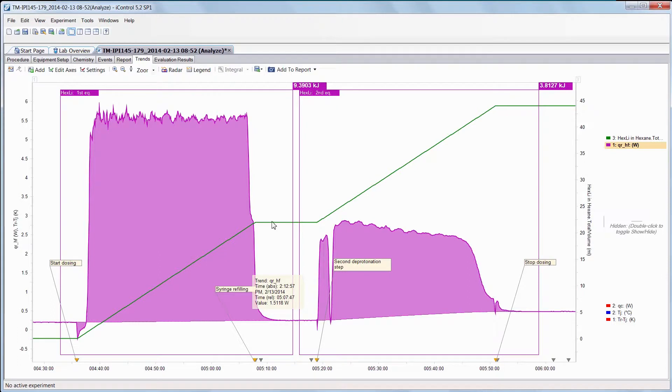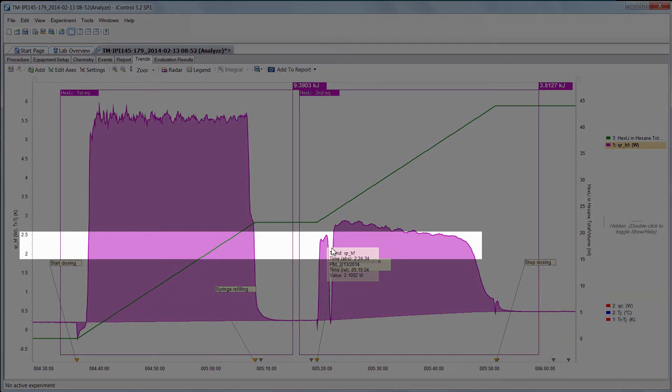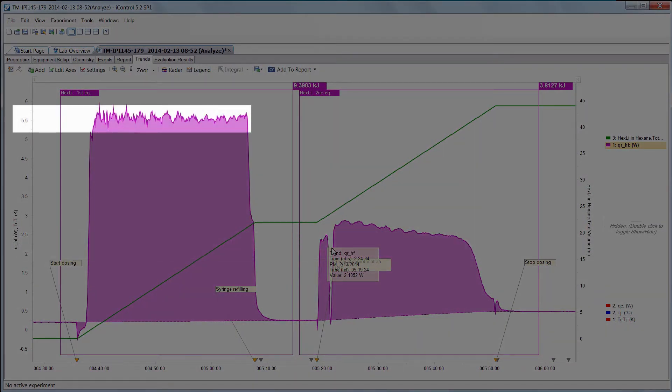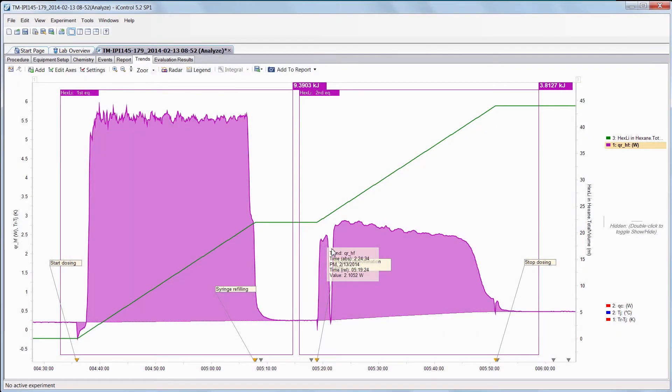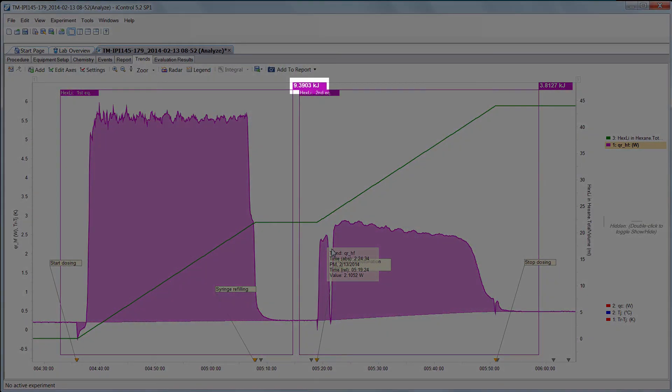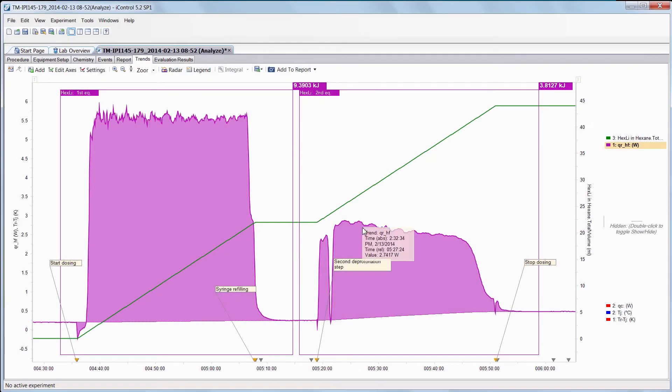The syringe refills and then starts adding the second equivalent of base, and you can see a second square wave where the amount of energy is actually about half what it was during the first deprotonation. You can see that by looking at the instantaneous heat profile: it's about 2.53 W of energy versus 5.5 W, and the overall heat was about 9 kilojoules versus about 4 kilojoules in the second deprotonation step.